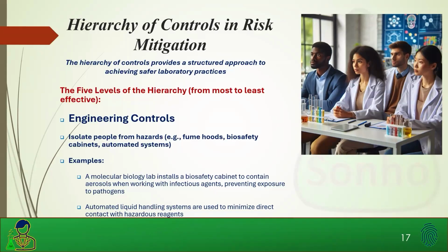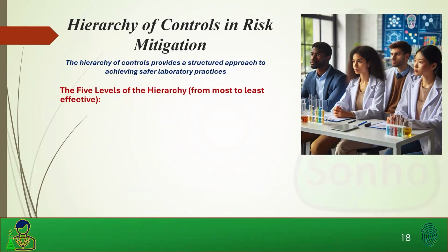Anytime you have a liquid handler, that reduces the exposure of the technician to the hazard, either the hazardous solvents or the hazardous sample. The matrices themselves could be considered bloodborne, and you may have to consider bloodborne pathogens or solvents. The extraction process itself could be toxic. And having automated liquid handlers helps reduce the risk for exposure.